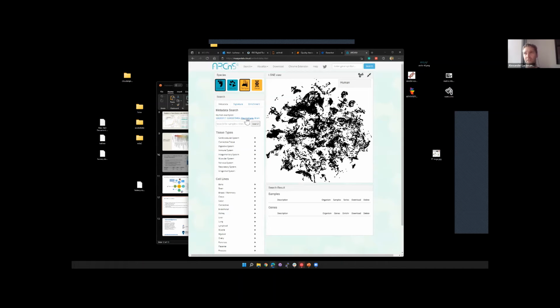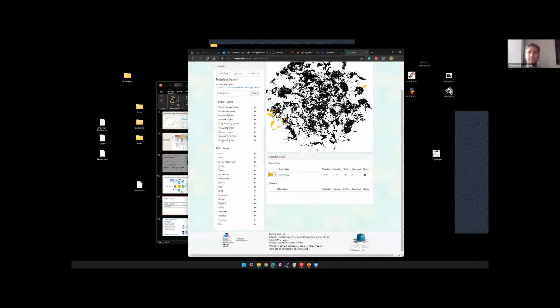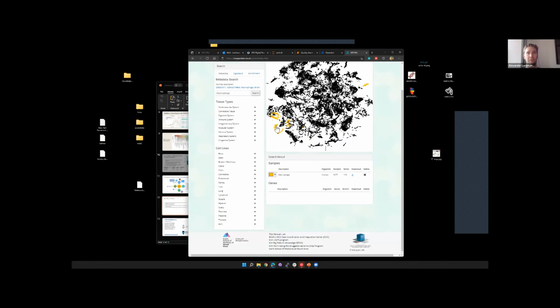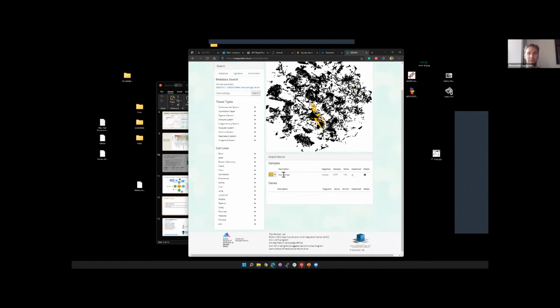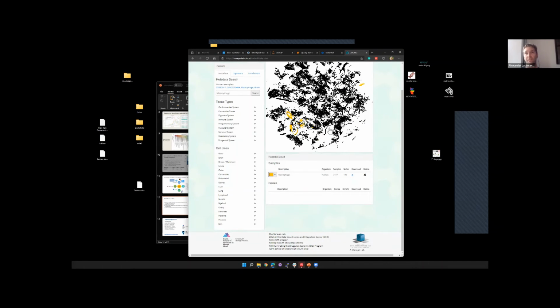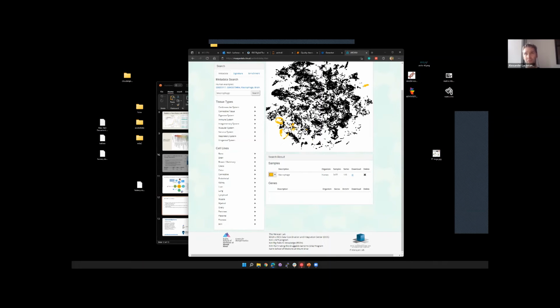Now we can actually search the data in real time. We can look for macrophages, for example, in the human data. We can see that there's a lot of macrophages in this area here. There's a cluster over here. Down here in the selector, we get this view. We found 3,500 macrophage samples, and we do this by searching the GEO metadata. This is from 150 different experiments, so it's pretty encouraging that they all seem to cluster together.